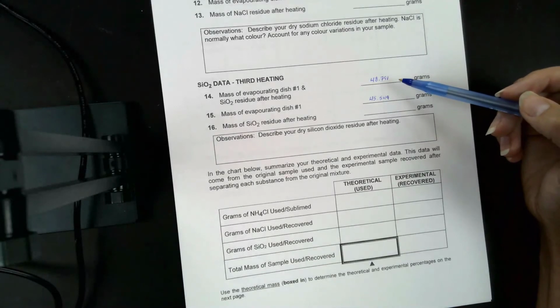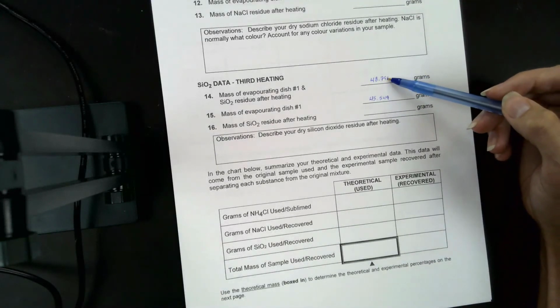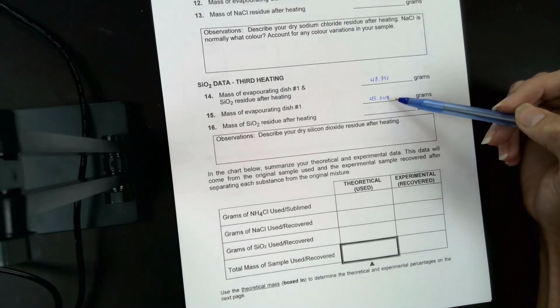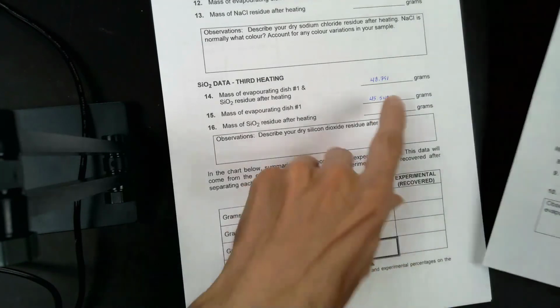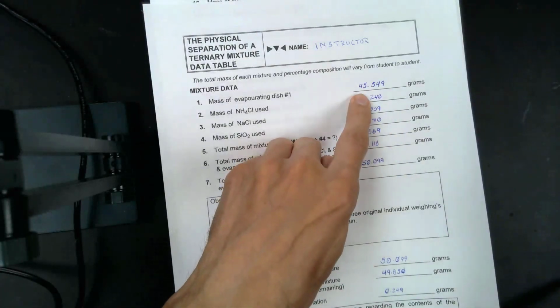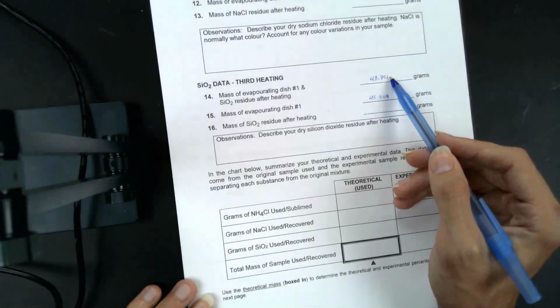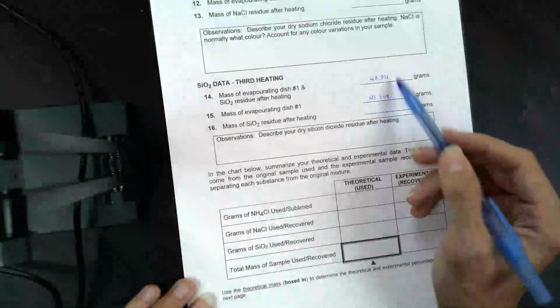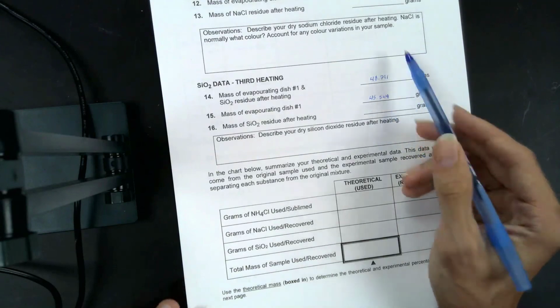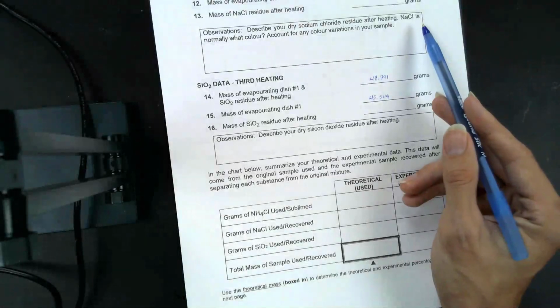Item number 14 is just the mass of the evaporating dish and the sand left inside of it. Item 15 was just the mass of the evaporating dish. Now this is the same evaporating dish I started with, and so actually this number is the same as this number, right? This was the empty evaporating dish, number 1, that I started with. So this value is what you put right here. Again, this is the dish with the sand, this is the dish without the sand, and so the difference here will give me the mass of the sand. And that's how you're going to get your experimental masses for the components of your mixture.